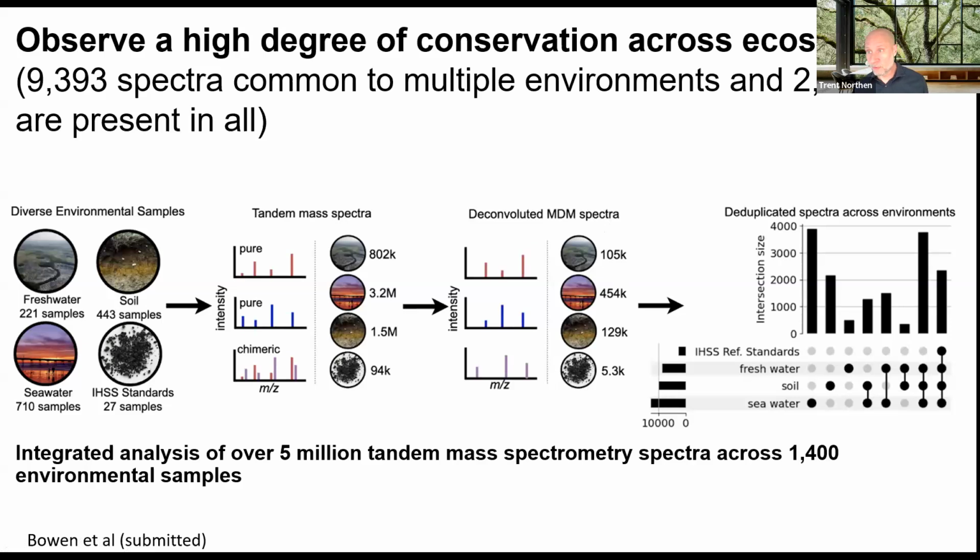So with these really similar molecules that have similar retention time and similar masses, you can actually capture multiple precursors with your quadrupole, and then you get these mixed fragmentation spectra. This is a really powerful approach for deconvoluting them using some knowledge of the chemistry of these systems.